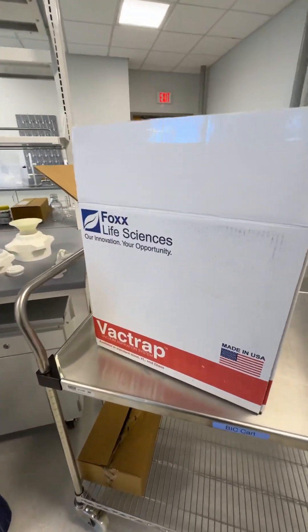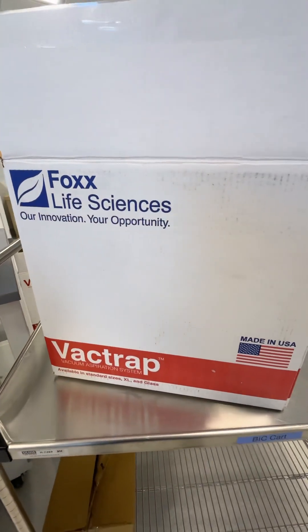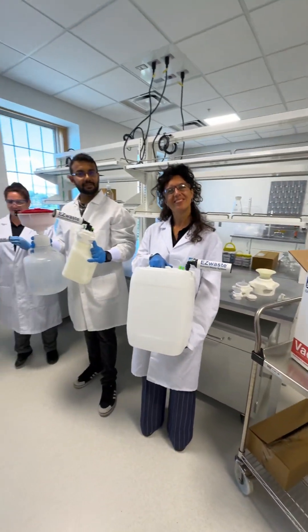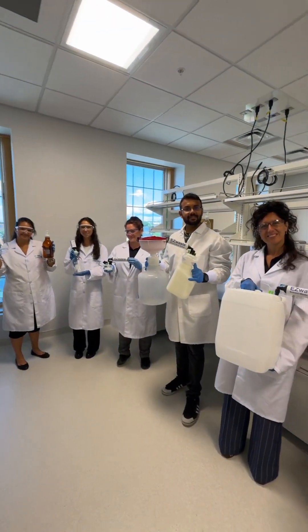We've got another great short video for you today from Fox Life Sciences. Everyone knows VacTrap, made in the USA, but guess what — we've got all kinds of lab safety products. You're going to want these.